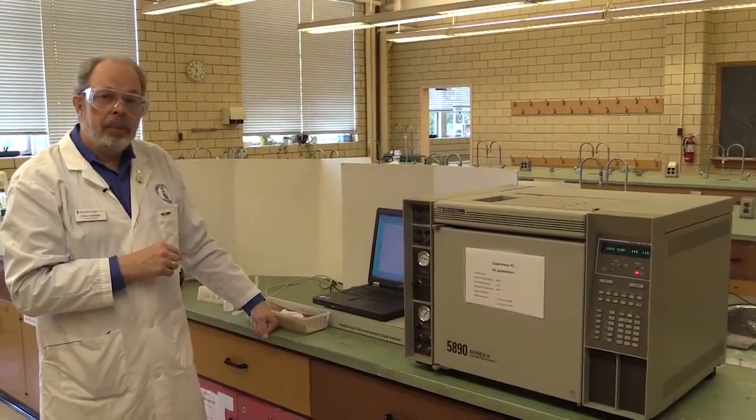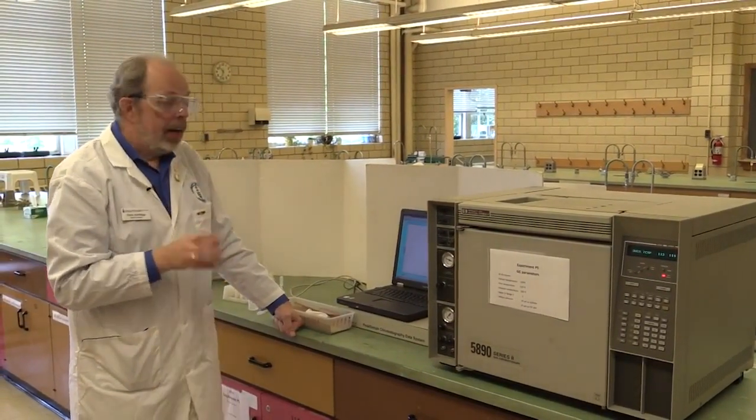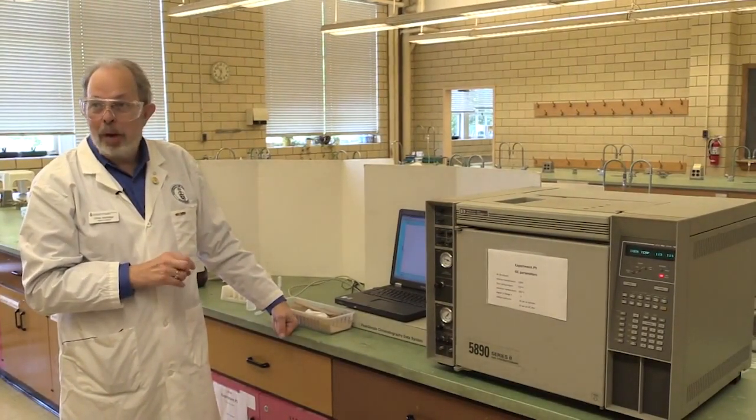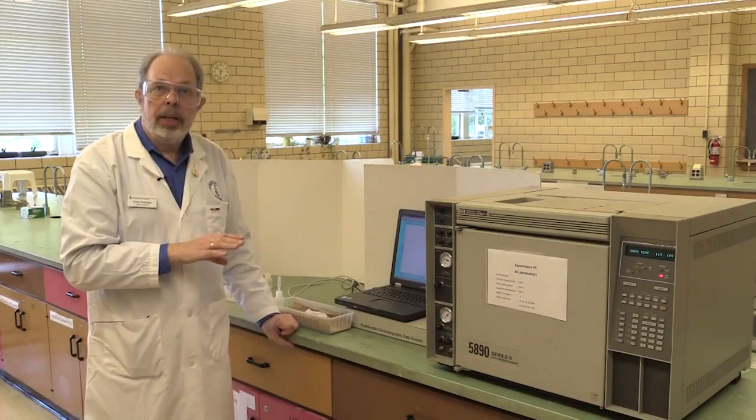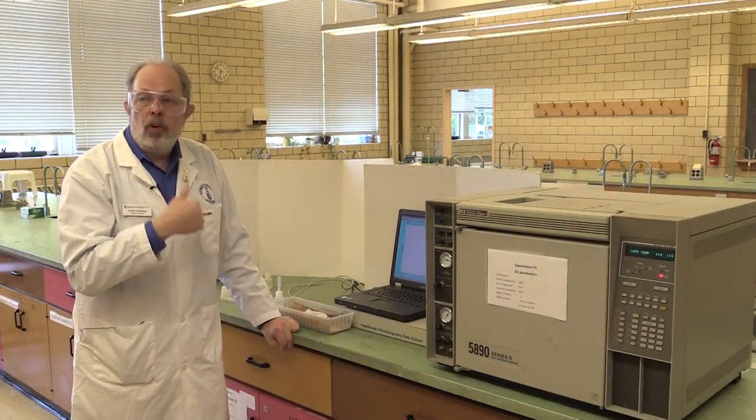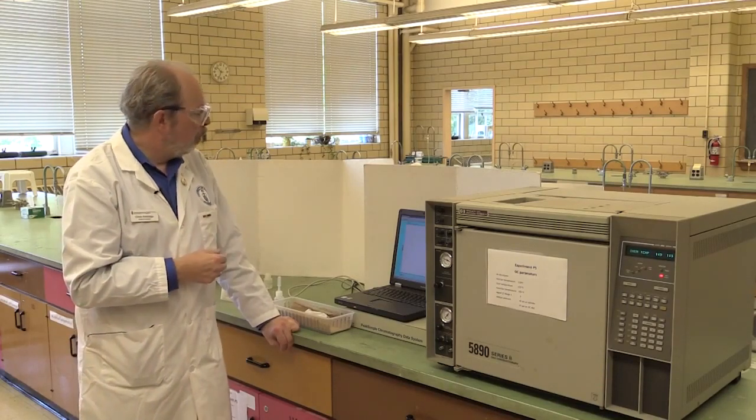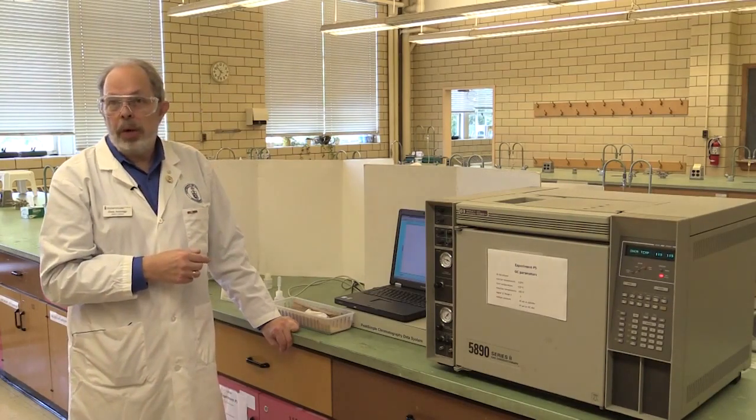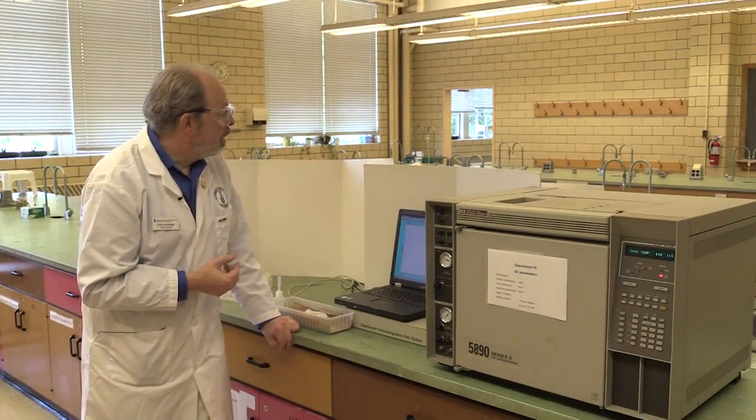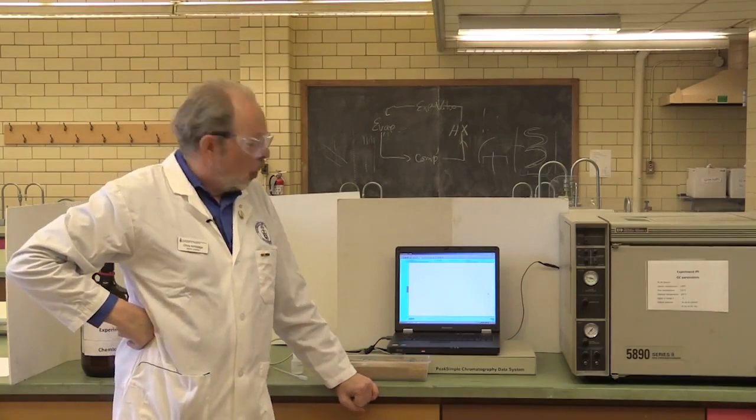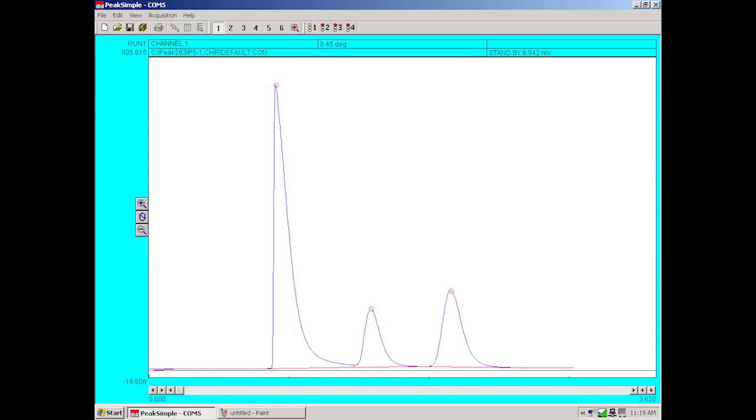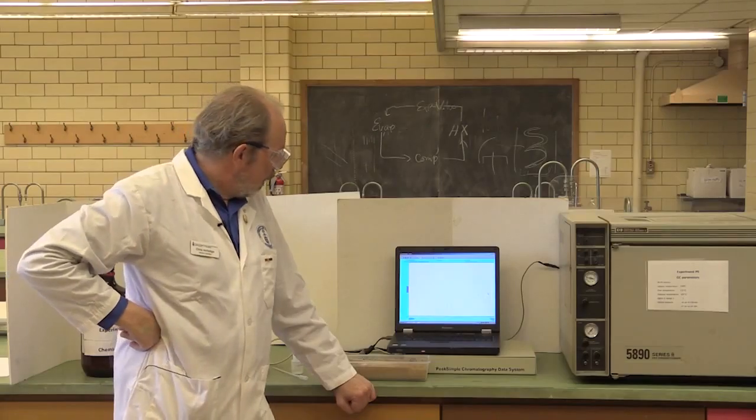All right, it is actually developing here on the screen. It may be a little difficult to see. I know from doing this many times that the first peak is going to come out at 0.8 of a minute. And we're at 0.35 of a minute. So when this comes out, eventually the instrument will time stamp each peak for the maximum height of a peak. The first one's about 0.8 with the setup as I've got it here. The next one's just over one minute. And the third one is just over two minutes. 0.7 of a minute. We're working on it here. And here we have the first peak coming out. And the second one will be coming out shortly. I realize that this is not going to be terribly easy to see on the screen, on camera. So we will insert some photographs of what these things should be.